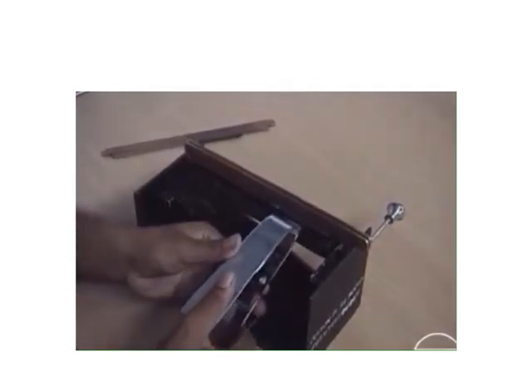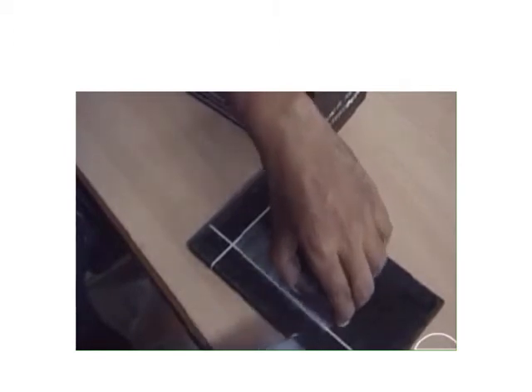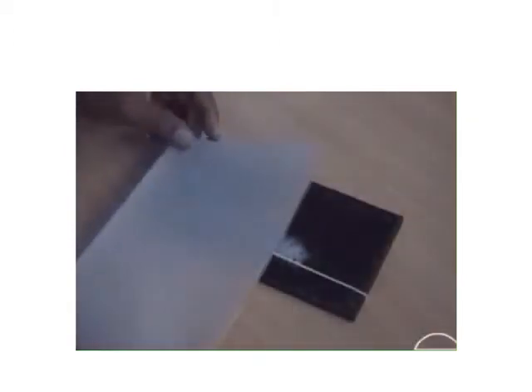See, you are placing nearby, not on the same. Then till the end, similarly, all the fibers are being pulled. So the purpose of this experiment is to arrange the fibers in descending order or in an array form, longest to the shortest fiber.